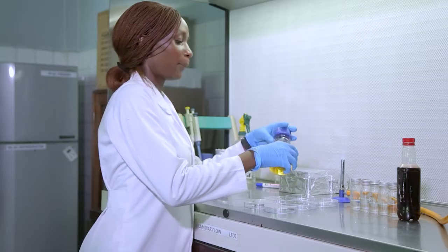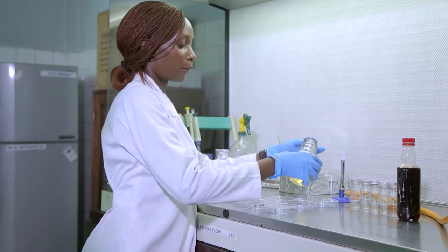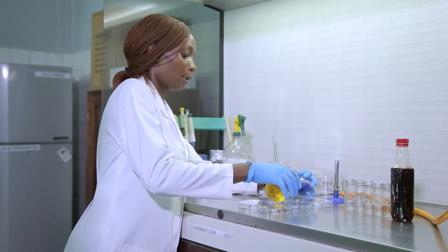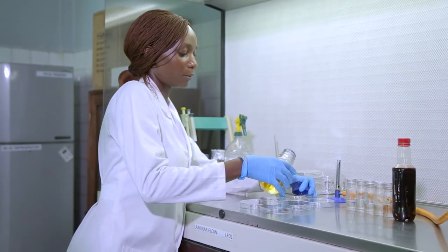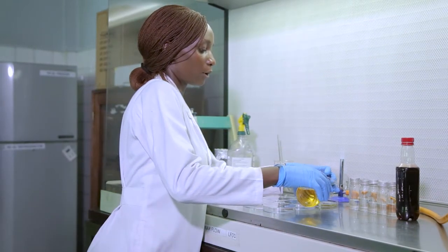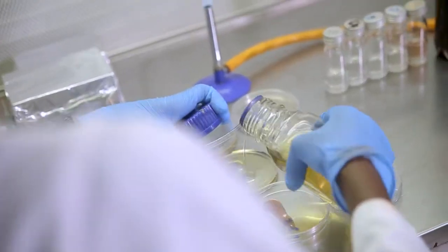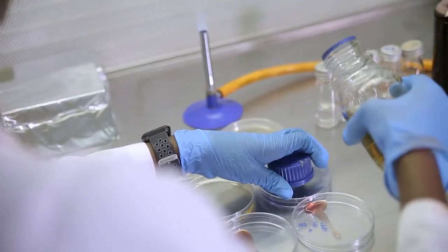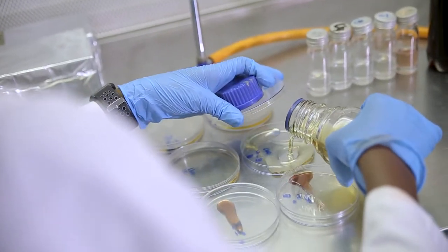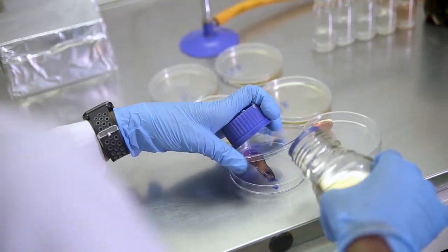So now we're going to pour about 20 mils of the molten agar onto the petri dishes. We quickly pass the mouth over the flame. So we open the petri dish slightly, add about 20 mils. 20 mils is, when you pour the agar and it reaches all the sides of the petri dish, that's about 20 mils. You may add a little more, okay? For this step, we try to be fast to avoid contamination. I know I'm speaking, but ideally you shouldn't be speaking because the medium we're using is non-selective. Okay, so we pour.